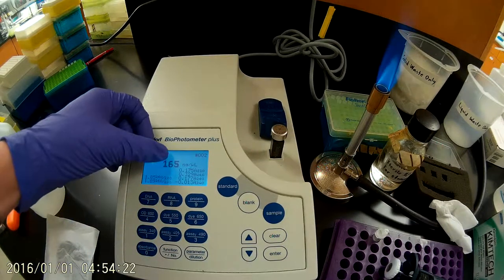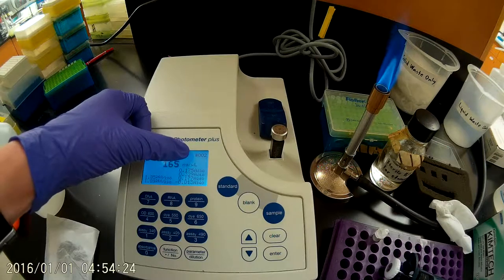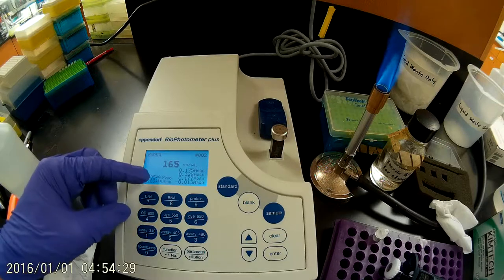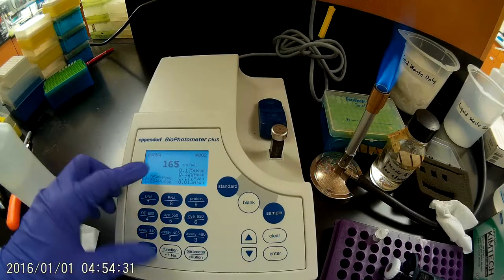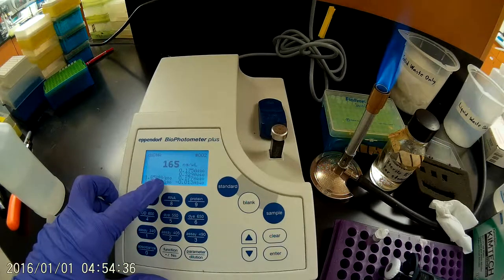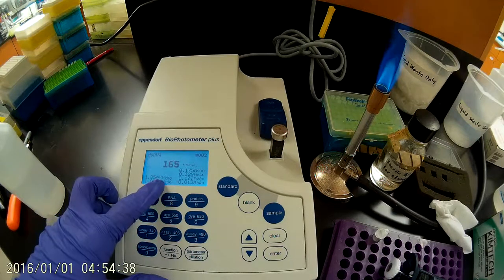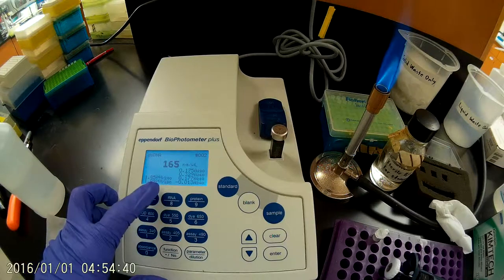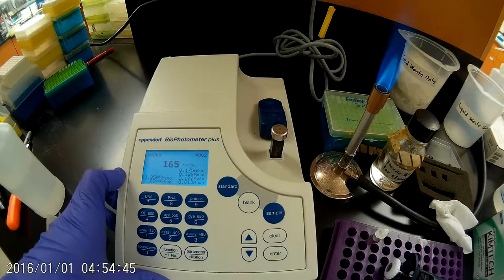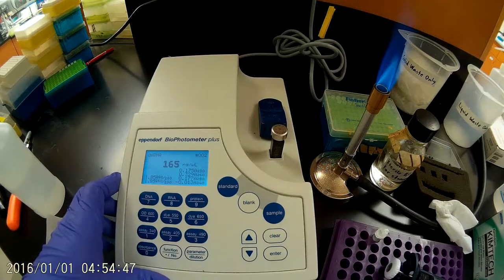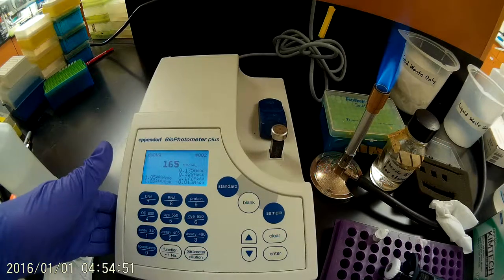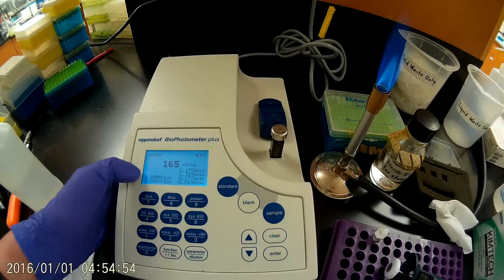Okay, so we see 165 nanograms per microliter. That's the concentration. As for our purity, we're really interested in this number here, 1.85 for the 260 over 280 reading. So that 260 over 280 is the ratio of the absorbance at 260 nanometers to the absorbance at 280 nanometers. For pure DNA, you expect a 260 over 280 of about 1.8. Pure RNA, you expect a 260 over 280 of about 2.0. Values lower than 1.8 typically indicate protein contamination. So this 1.85 is pretty good.